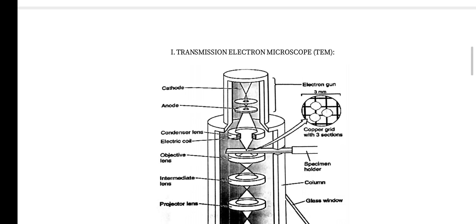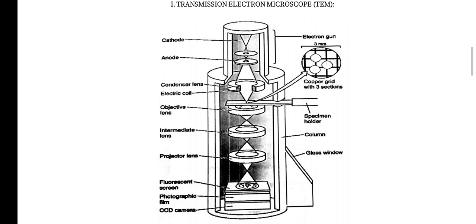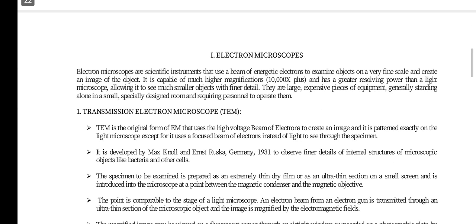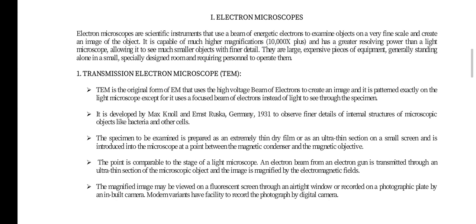The next instrument is the transmission electron microscope. This is the structure of the transmission electron microscope. Introduction about the electron microscope.